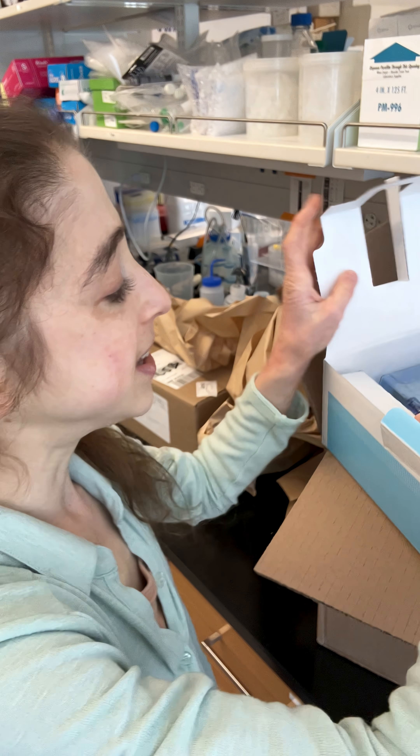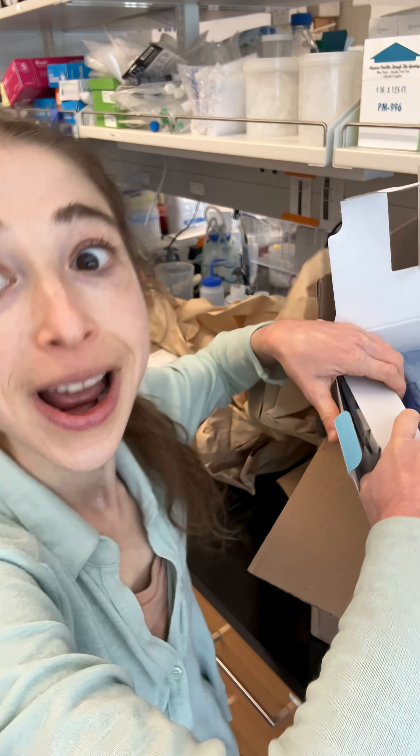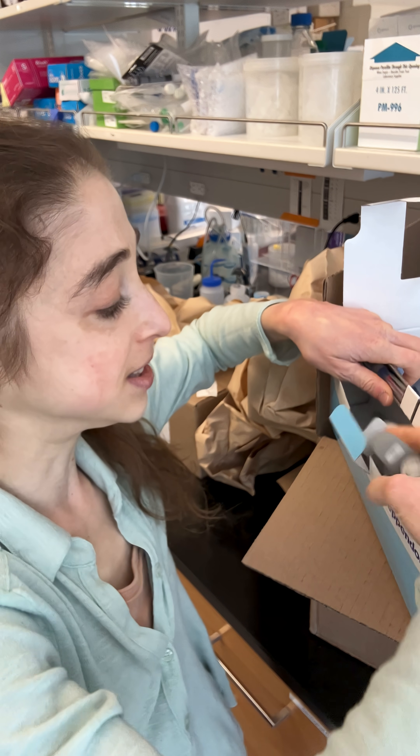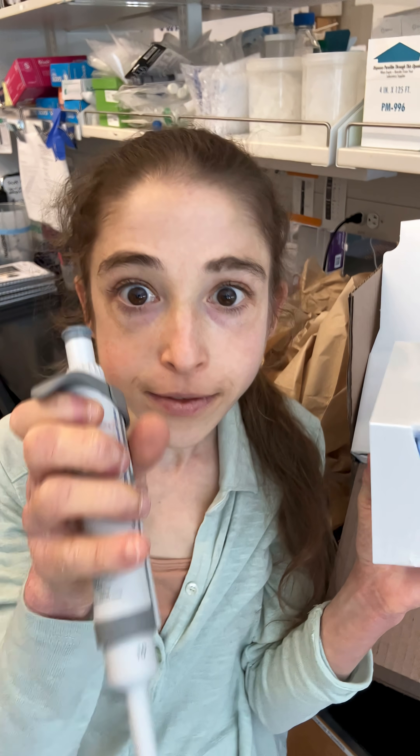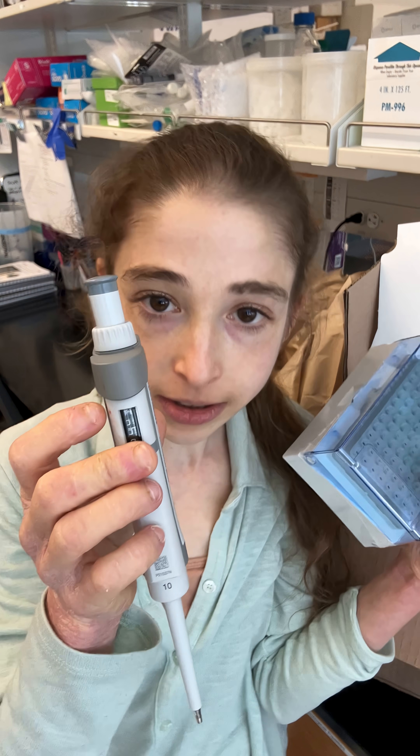But it really is the perfect size for so much that you want to do. And it uses the small tips instead of the big tips. P-10 is my favorite micro pipette. It does 0 to 10 microliters.